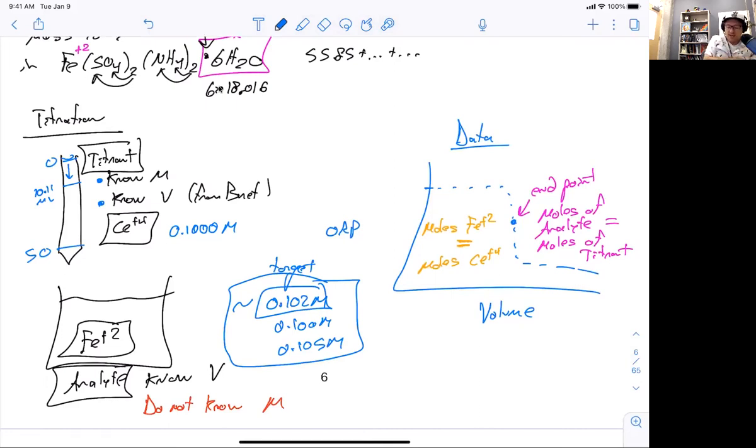As soon as we weigh it out, it's going to be really hard to get exactly 0.102. Just write down whatever the scale is saying, and don't spend 20 minutes there trying to get an extra little granule either on or off the weigh paper. It's not really worth your time. So it'll be okay if it's 0.105. Again, you write the number that's on the scale, and then you kind of back calculate: oh, I was going for 0.102, but I actually ended up making 0.105.